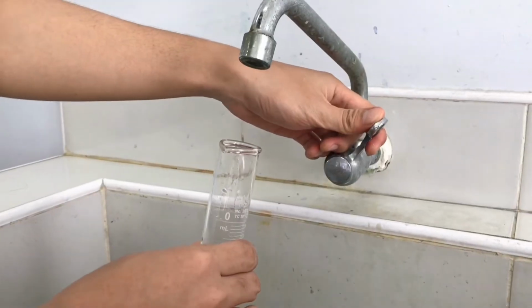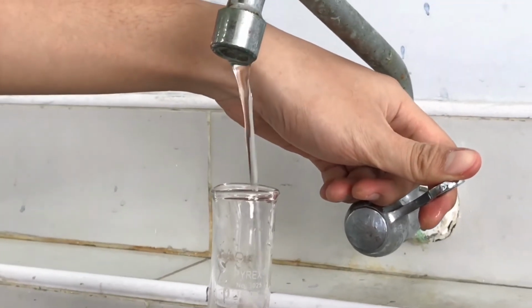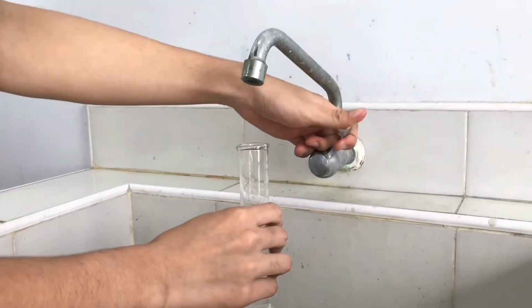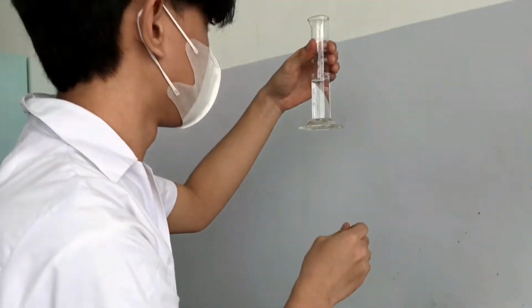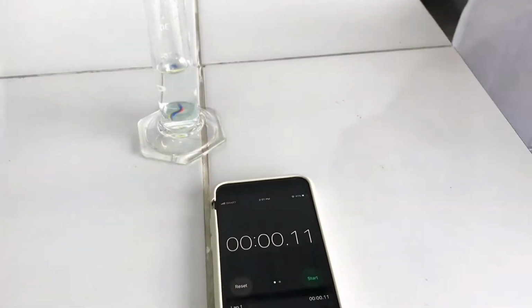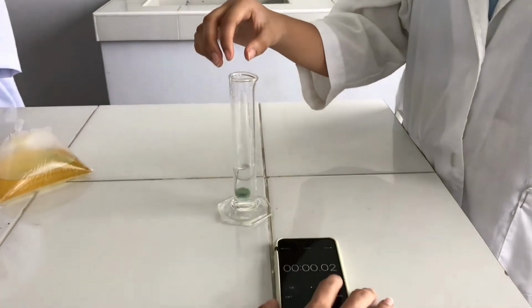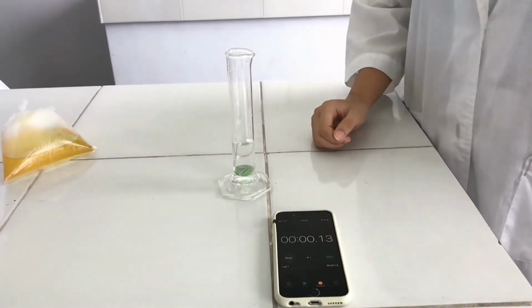Procedure A. First, put 20 ml of water into the graduated cylinder. Next, grab the marble at the top of the cylinder and use a timer to record the time for the marble to reach the bottom of the cylinder. Repeat the trial 3 times.